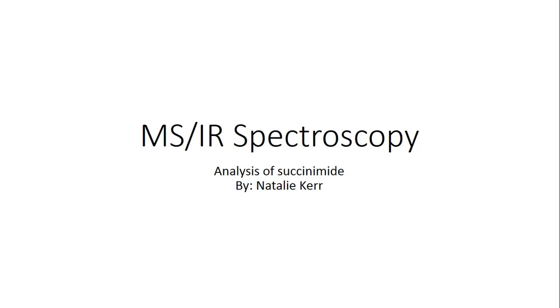My name is Natalie Kerr, and this is my MS IR spectroscopy video, and in it I will be analyzing succinimide.